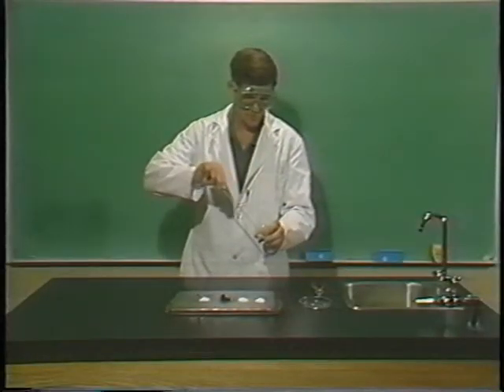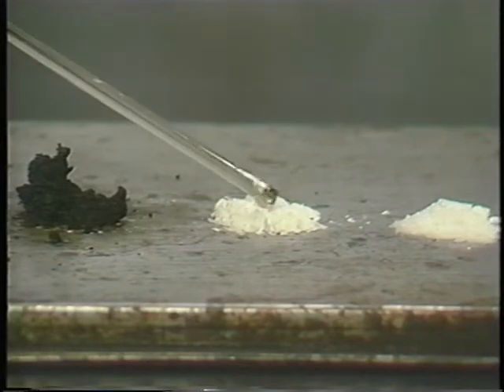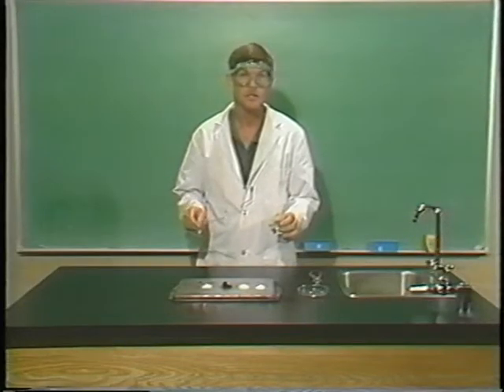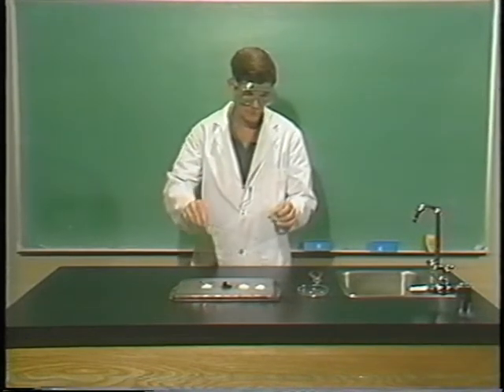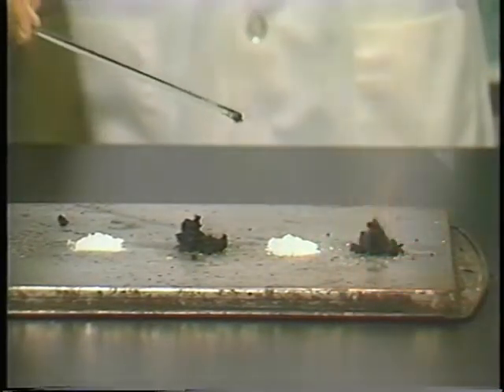Now let's test number three. One drop of water on chemical number three. And once again, we can see that it does very little. And finally, chemical number four. Let's see what happens when we put our drop on that. Whoa, it's like another one of those.